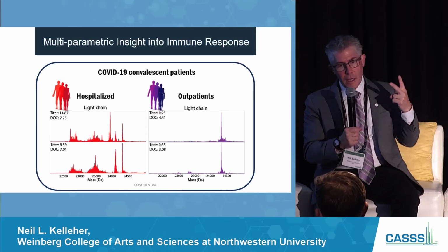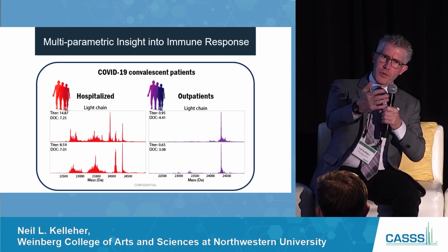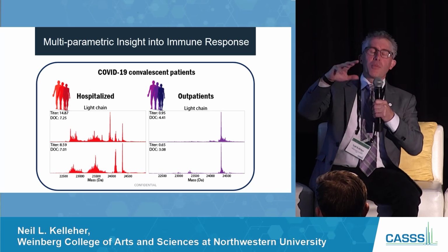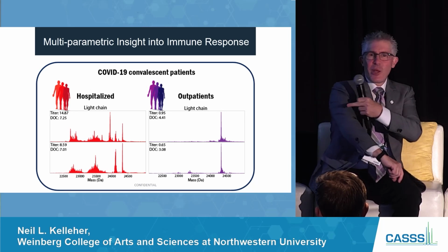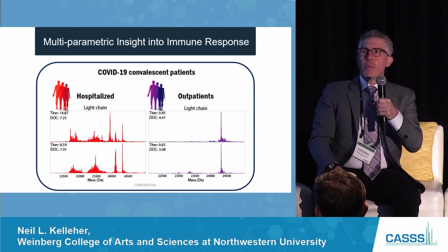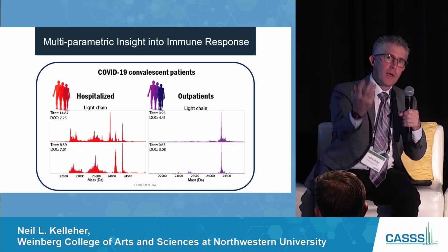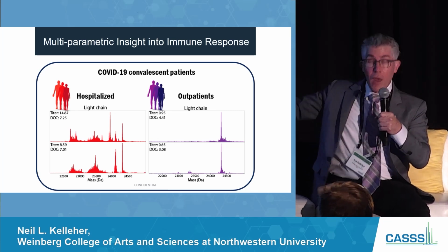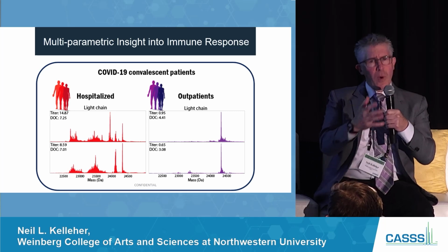Second thought is the direct answer about what proteoforms there are, like sometimes there's glycosylation on some of these encoded epitopes, and so what's the glycoproteoform distribution that's sitting there, okay, I just got a shot, and is the technology up for it? I believe it is, but you would have to have an immunoenrichment of the encoded protein, so you need a really good antibody or other affinity reagent to pull it out. And now with this trace level, we can handle sub-nanogram amounts of material, and so I believe it to be possible.